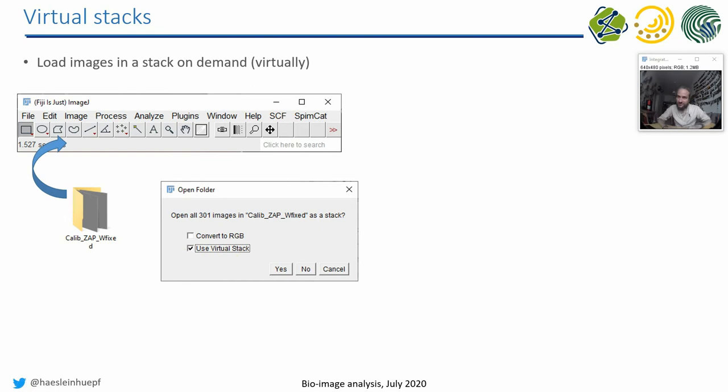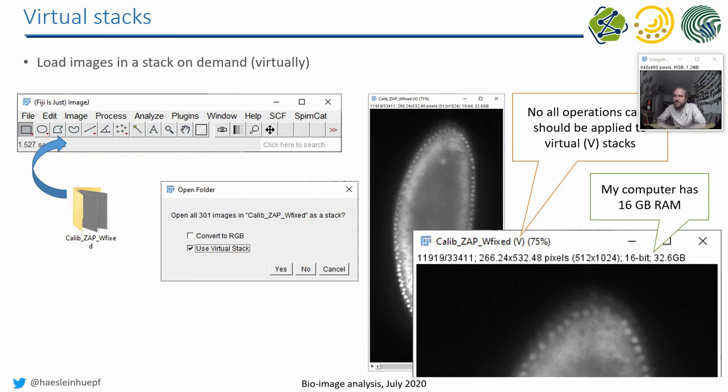Then you will see your dataset. For example, this one here is 32 gigabytes large. And 32 gigabytes don't match in the memory of my laptop. So I can look at data which is larger than my memory by using virtual stacks. You will always see this V here behind the brackets of the file name.